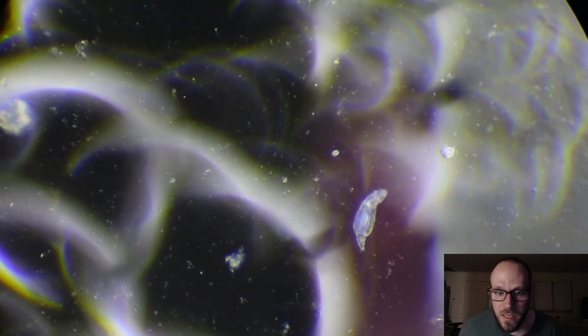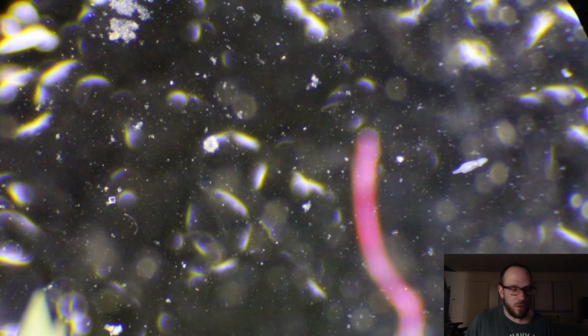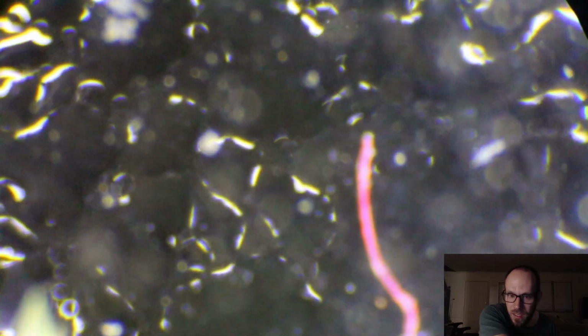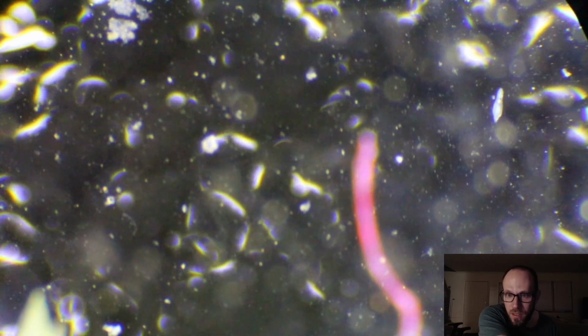But yeah, you can see inside this guy. You can see his organs. He's doing a stupid thing, though. I don't like him anymore. There's so much on this slide that we don't need to focus on him. What is this pink thing? Looks like a piece of string, actually. It's atop the slide. Can I see it? Not really.